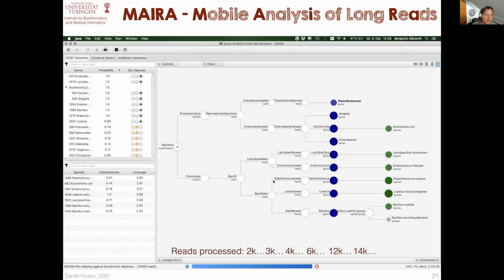And because you're doing protein alignment now in real time, or quite fast, on a laptop, we use a two-stage process. As reads come in, we first have a database where the proteins represent different genera. We don't do a very detailed analysis, just a lightweight analysis, trying to figure out which genera seem to be present in the sample. And once the score that we keep for each genus exceeds a certain threshold of 0.8, we then run the reads against a genus-specific database.